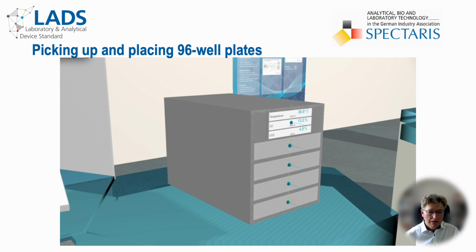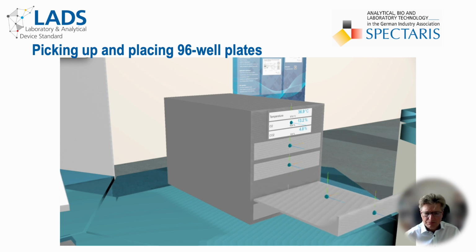After a while, another invisible robot approaches with a new 96 well plate to be incubated. The drawer opens, exposing the position where the plate should be placed. The robot inserts the plate at that exact spot and the drawer closes.